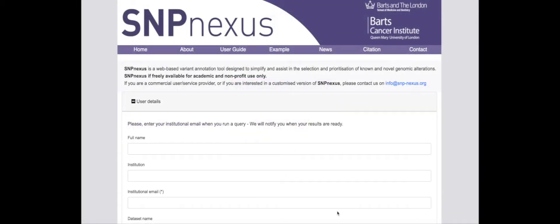While the example of use I will present next is focused on cancer, SNPnexus can also be used for a variety of other disease applications. This includes the identification of variants associated with diseases or traits in genome-wide association studies.